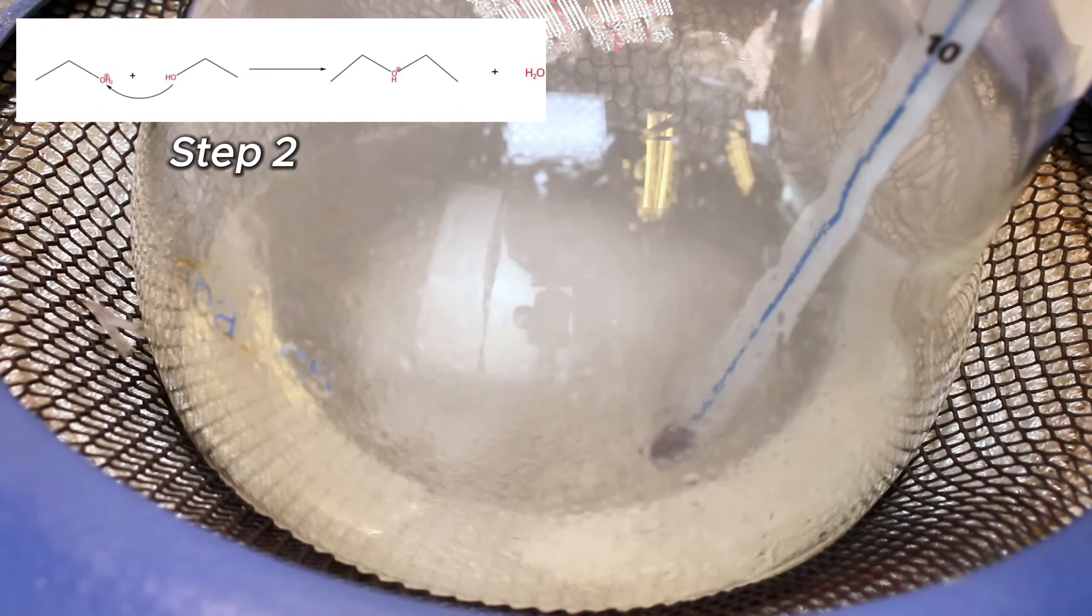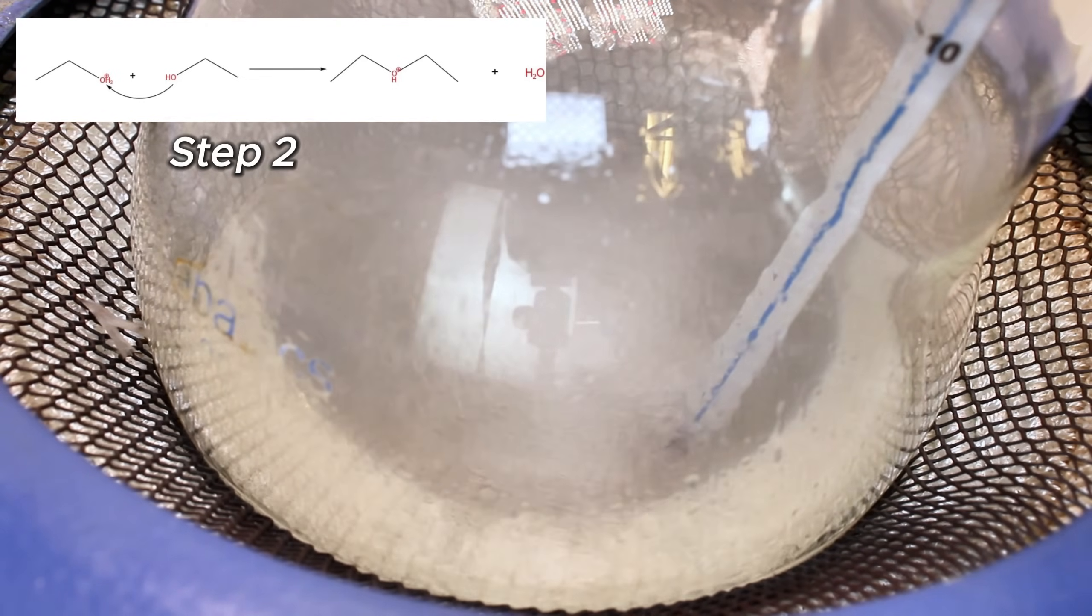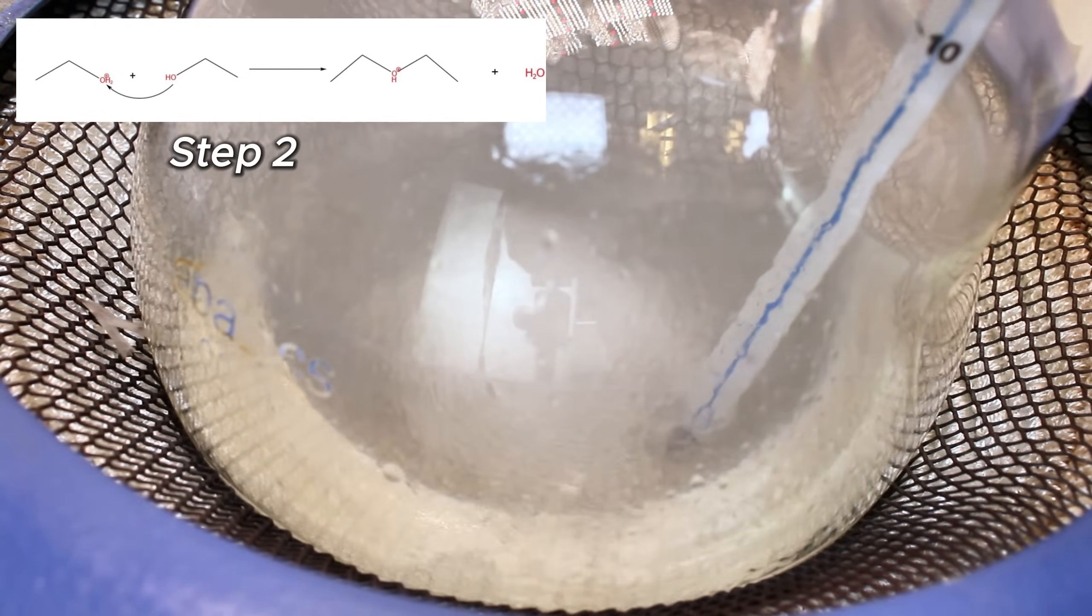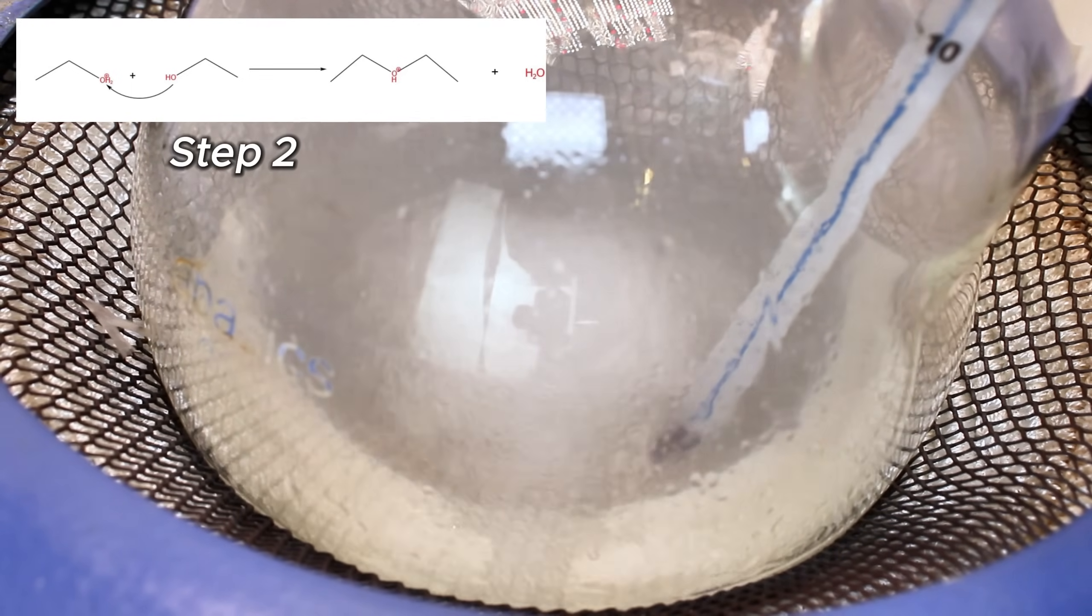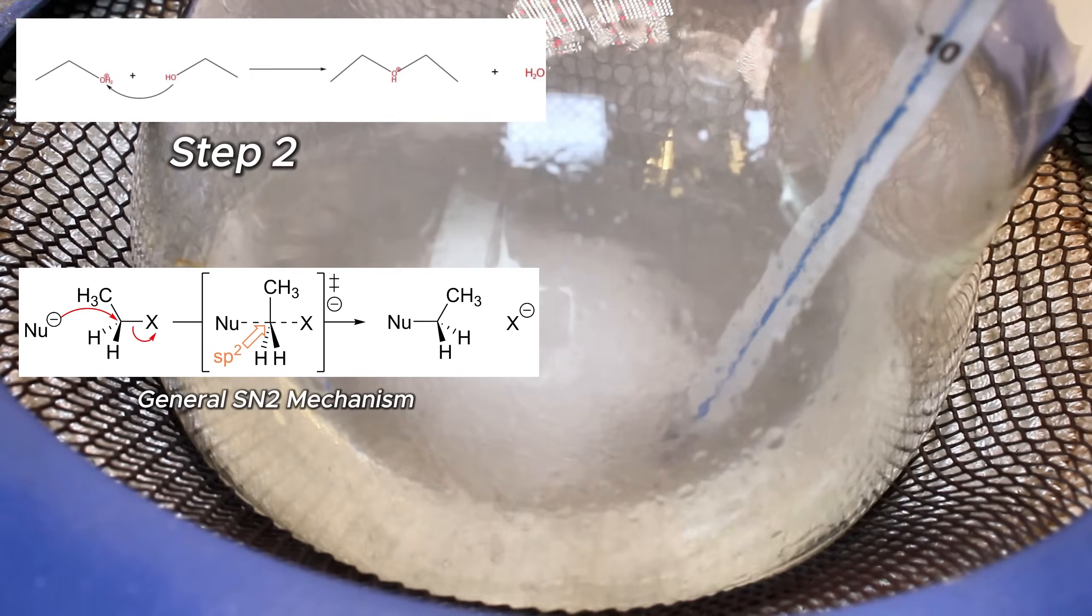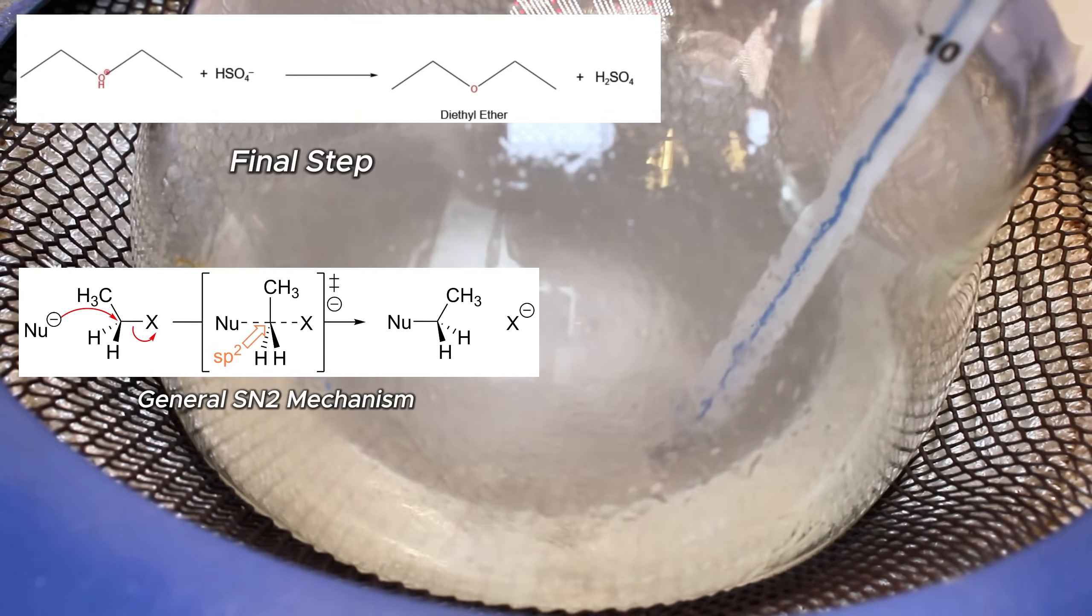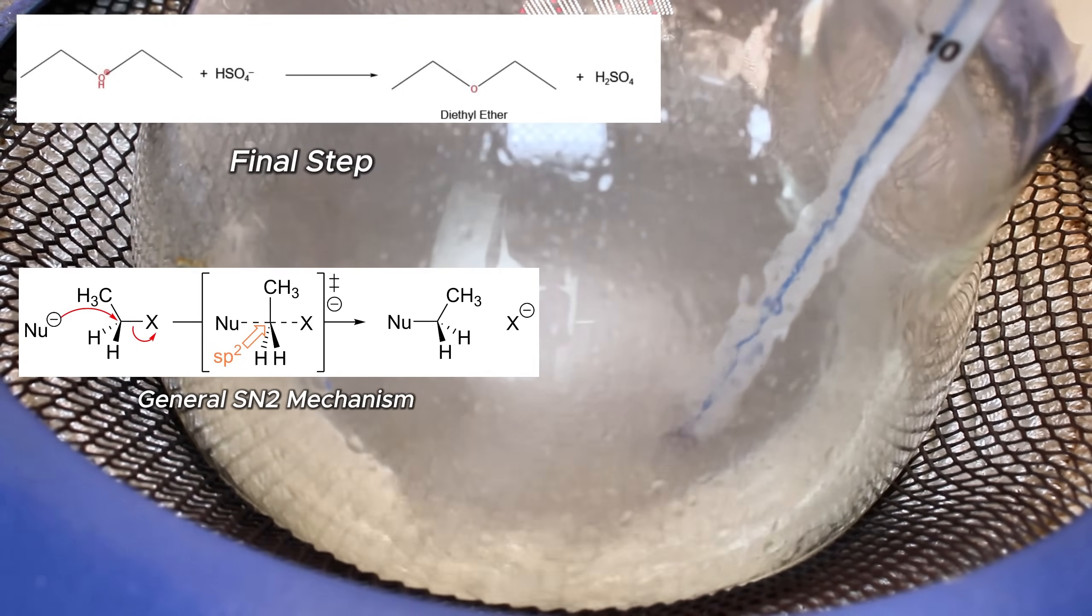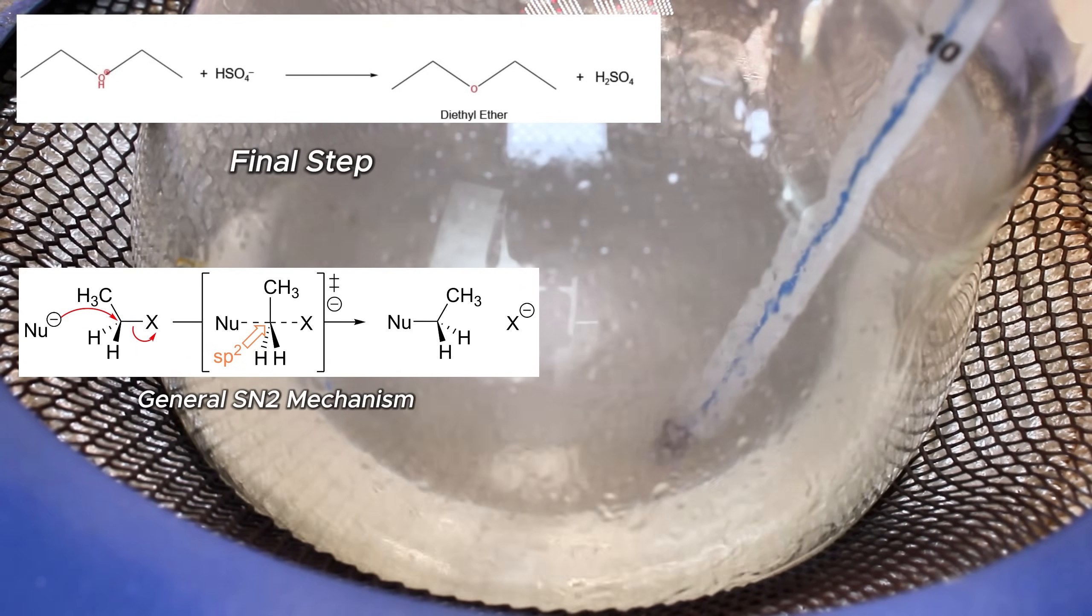In the second step, a nucleophilic oxygen atom of an unprotonated ethanol binds to the electrophilic protonated ethanol and simultaneously displaces one molecule of water, which makes this an SN2 reaction. In the third and final step, the ether molecule is deprotonated, which reforms the sulfuric acid catalyst and liberates gaseous diethyl ether.